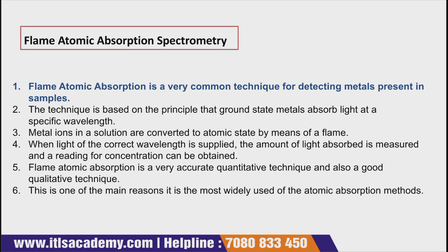So here a question arises: the metals that are present in our samples, which analytical technique is used to detect those metals? So the answer for this is flame atomic absorption spectrometry.